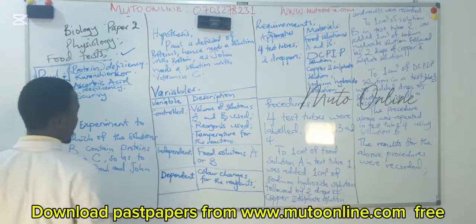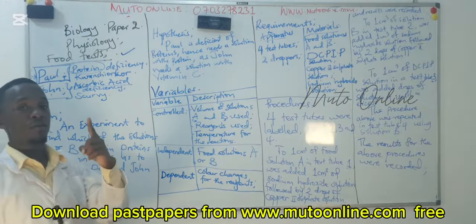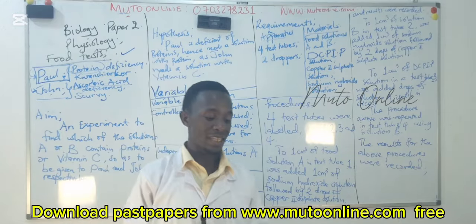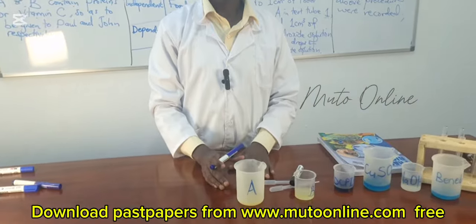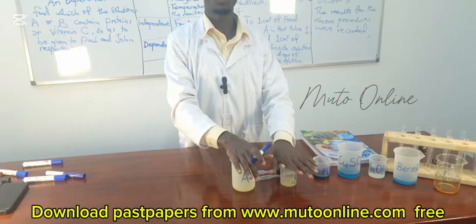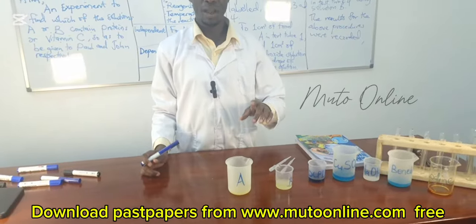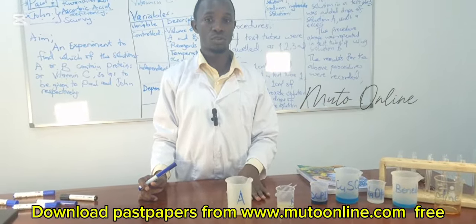This practical is an open practical now. The question may be about one food nutrient, and they want you to compare the amount in each of the solutions provided. They may contain the same food nutrient when the question is requiring you to test for the amount in each food solution.